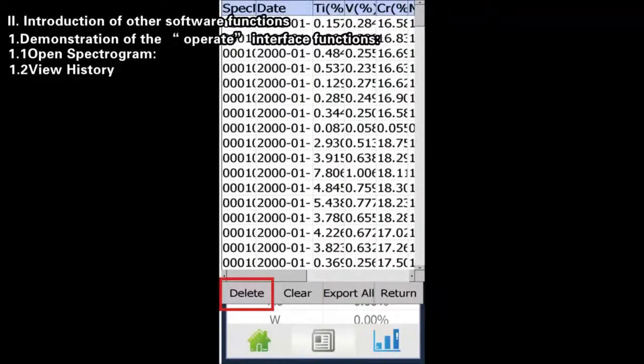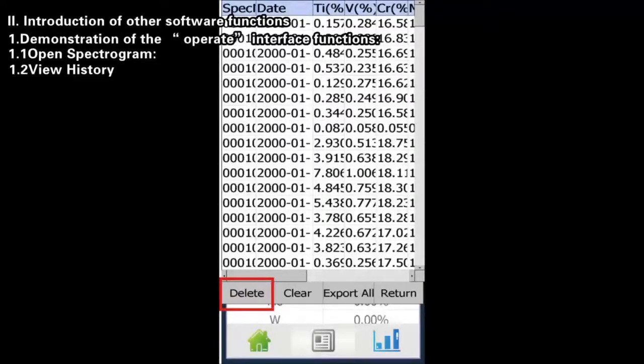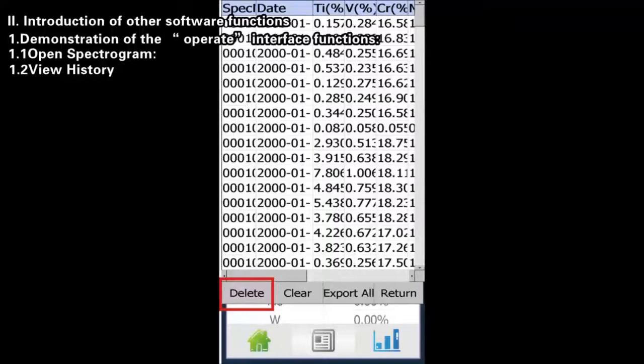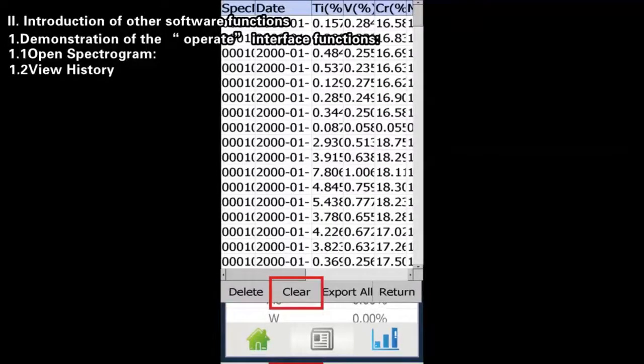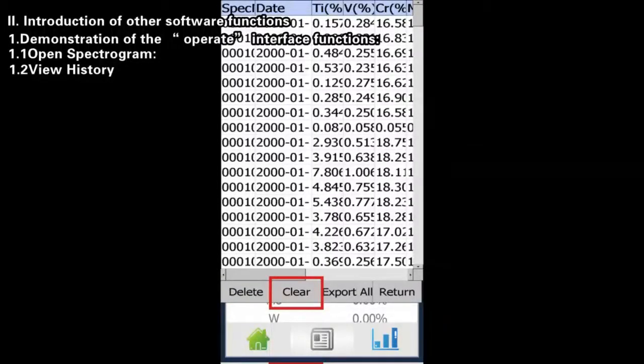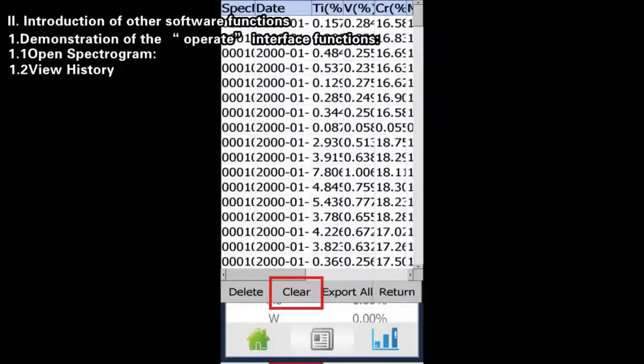Delete: Select the Spectrogram and click the Delete button to delete this spectrogram. Spectrogram of standard sample cannot be deleted. Clear: Click the Clear button to clear the data in spectrogram. Spectrogram of standard sample cannot be cleared.